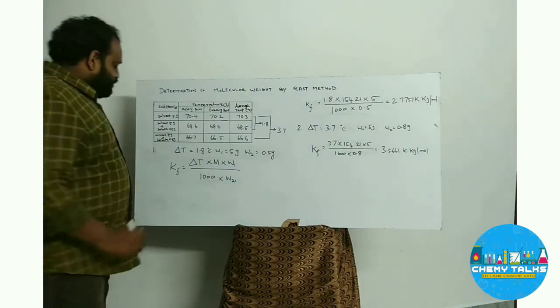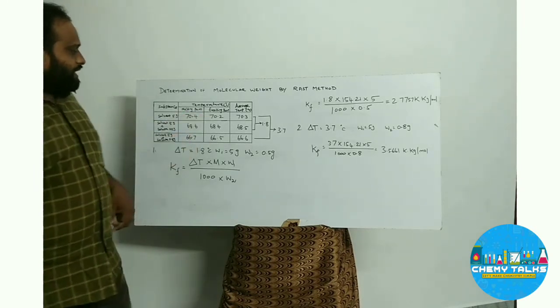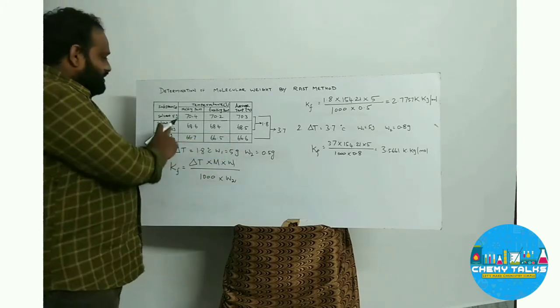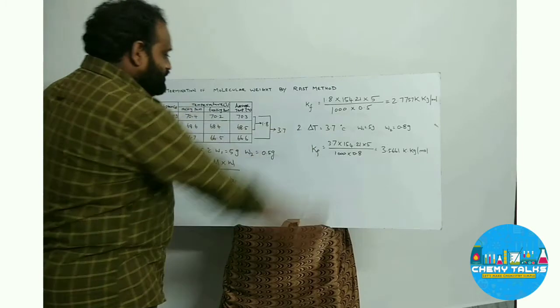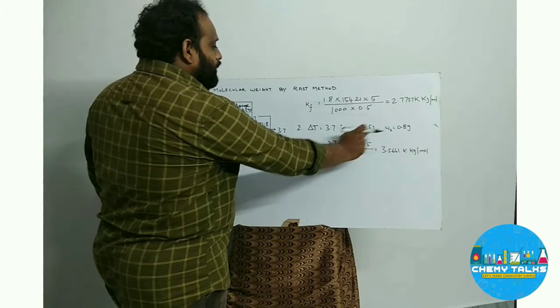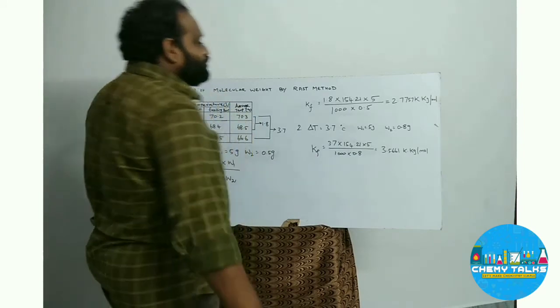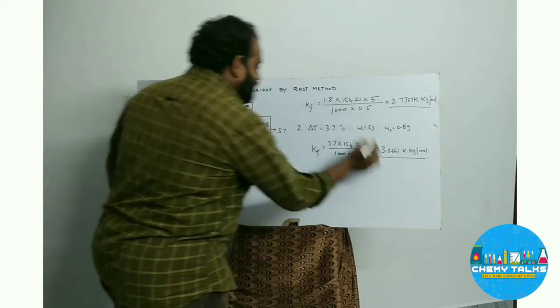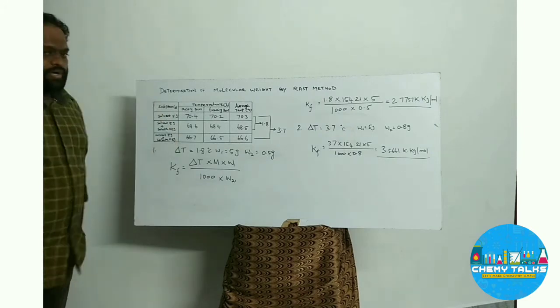Further addition of solute to the solvent still lowers the freezing point, to an average of 66.6. The temperature difference between the solvent and solute is 3.7 degree Celsius. Applying the change in temperature and the values of solvent and solute gives the Kf value. So we have obtained two different Kf values for two different amounts of solute added to the solvent.